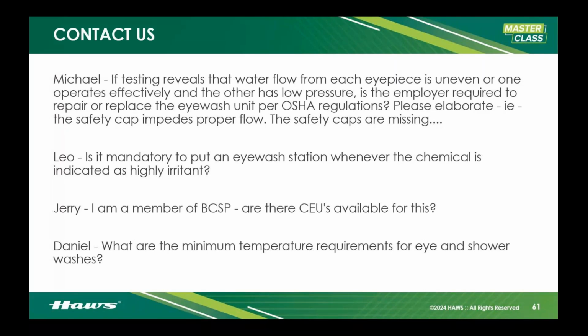An eye wash is fine, but it has for a long time been an outdated way to rinse your eyes, because the likelihood that something is going to spray or also affect the soft tissues of your face is high. So an eye face wash is ideal. For an irritant, you want an eye face wash and safety shower.